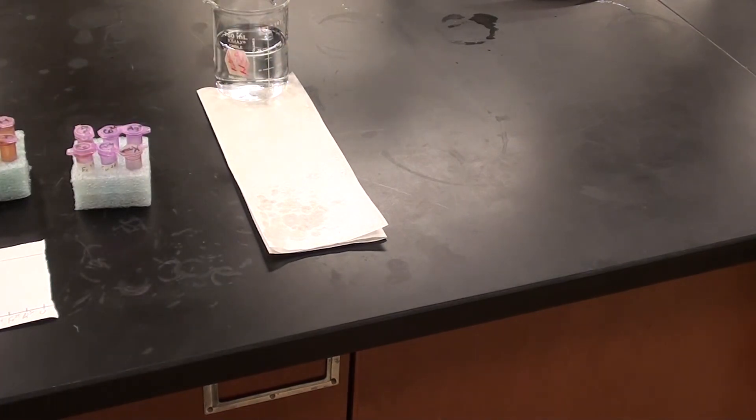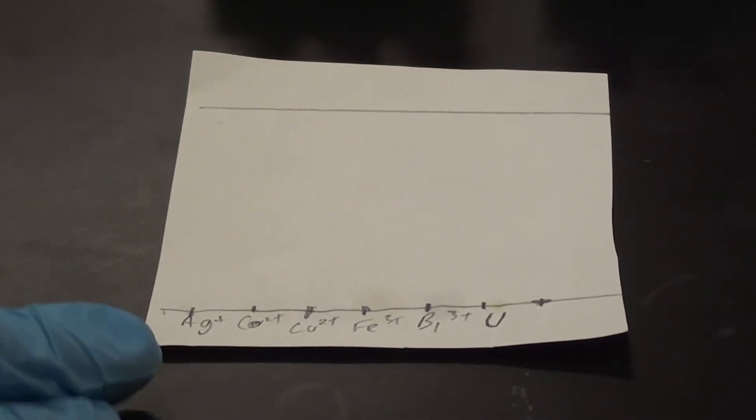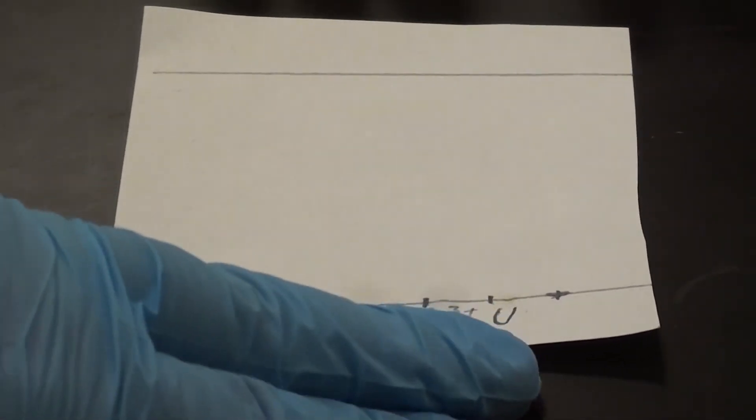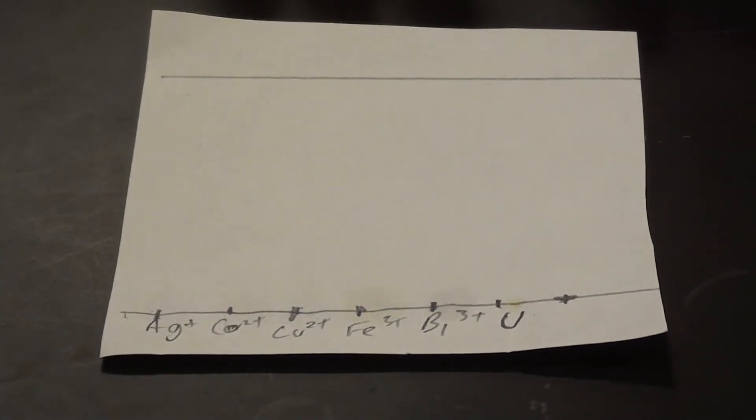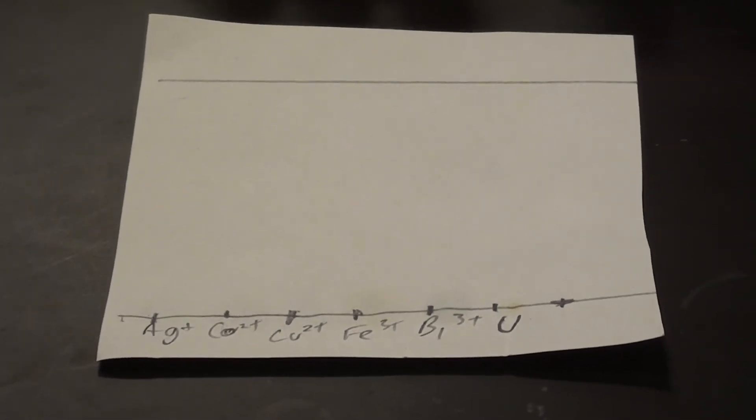So I'm going to spot all the samples on here and then we will develop it. Alright, so what I've done is I've spotted these, I've got the Ag+, the Co2+, the Cu2+, the Fe3+, the Bi3+, and I've also spotted an unknown as well. The unknown could be a combination of two to four of any of those ions that we have listed there.